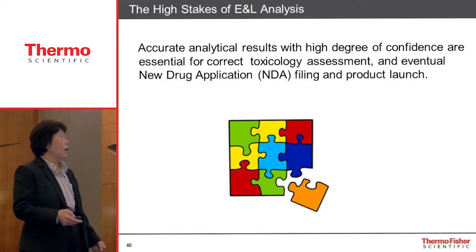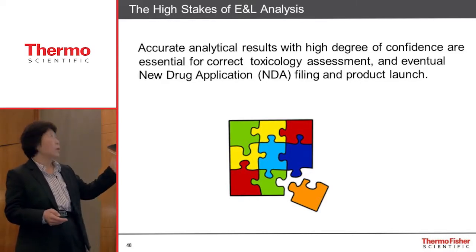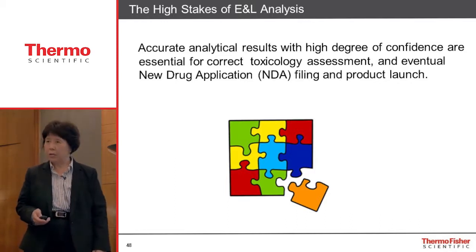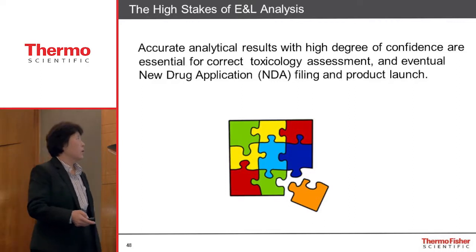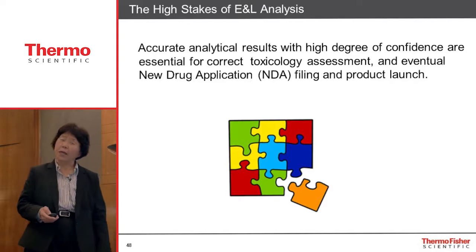So I think we are all a piece of this big puzzle. And instrument analysis is a very important piece, because based on that you do your toxicology assessment and the eventual new drug application filing and put your product on the market.